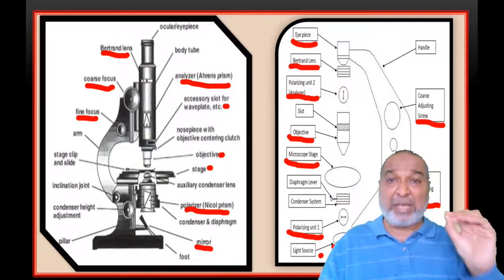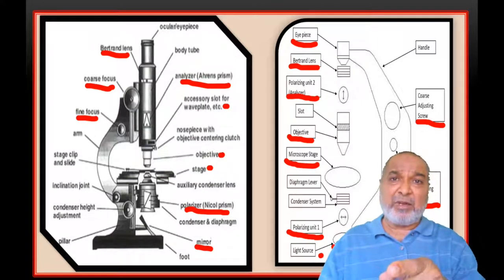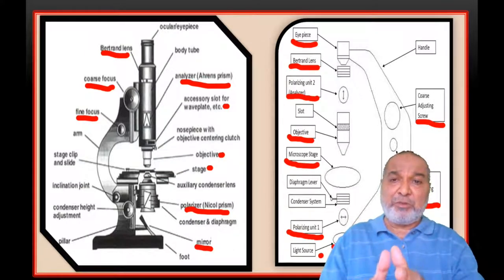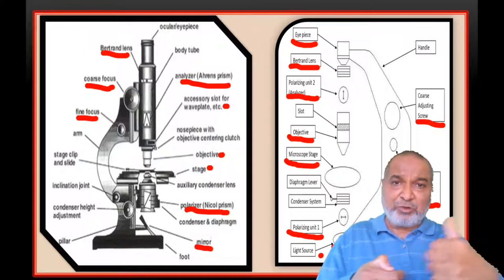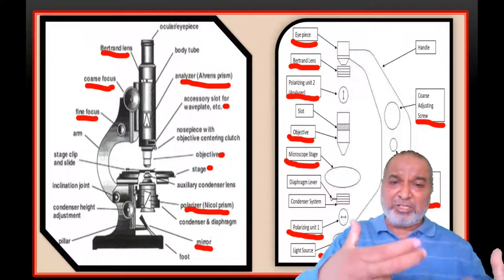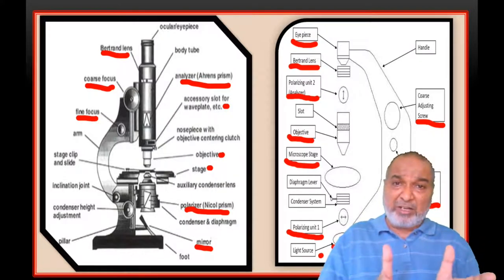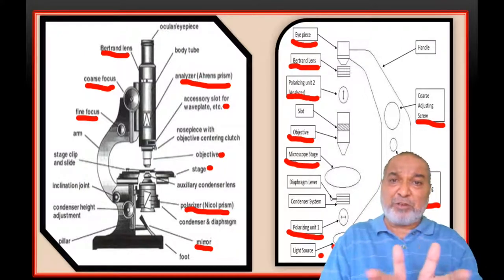So it should always be out. Whenever you go under the microscope, see that the analyzer should be out, as well as the Bertrand lens. This is the first simple observation we have to make. Once you go to the microscope, see that on that particular wave plate, it is written: in is written here, out is written. Whenever you put it, hold the tube with your two fingers and just press it out with the thumb. From the left and right, you can put it in and out with these two fingers, so that the path of the light should not be diverted, or the position of the microscope should not be shifted.